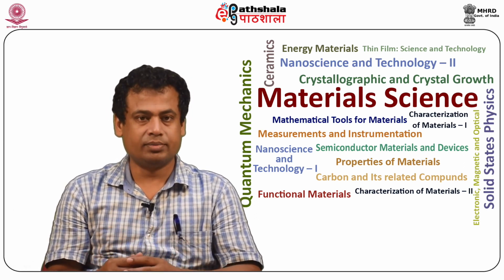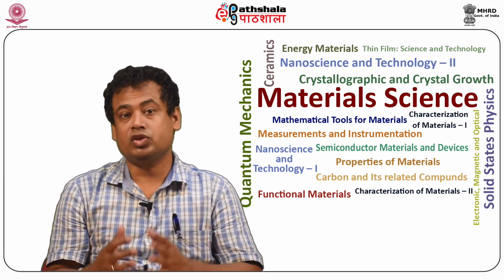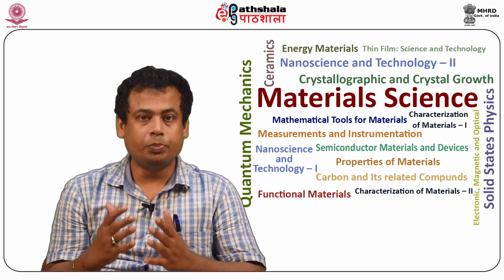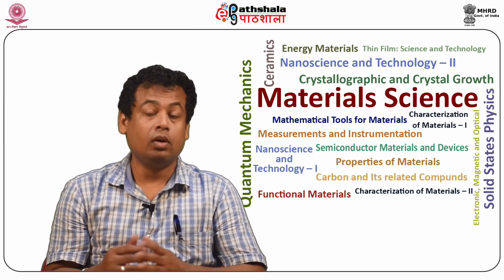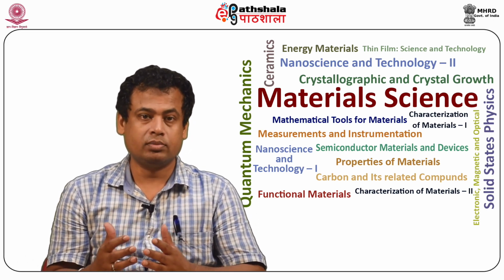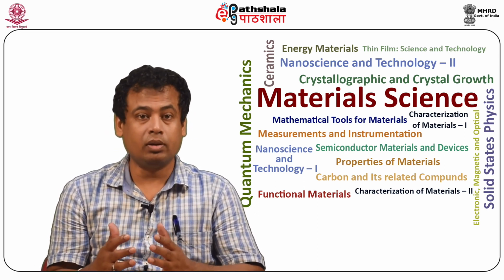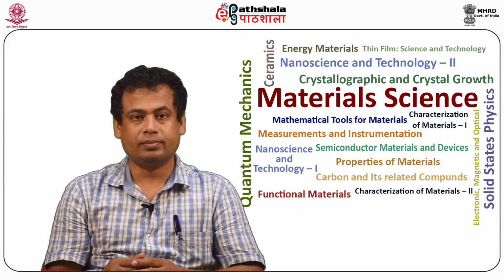A scanning electron microscope is an electron microscope that utilizes a focused beam of electrons to produce images of a sample surface. Various signals are produced by the electrons' interaction with atoms of the sample that contain information about the sample's surface topography and composition.